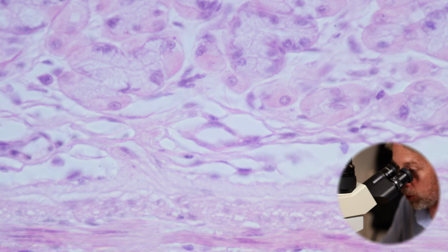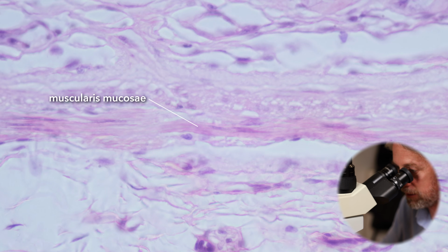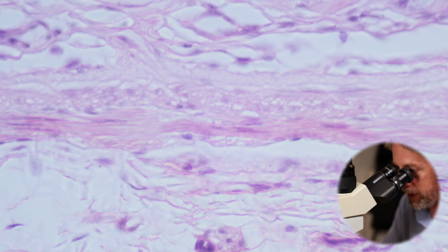So there's the lamina propria, that connective tissue layer, and then the next layer next to it, we've got a very thin muscle layer here. So this is the muscularis mucosa, and this thin, smooth muscle layer is probably going to help squeeze this tube and help squeeze the contents out of the glands into the gastric pits, maybe.